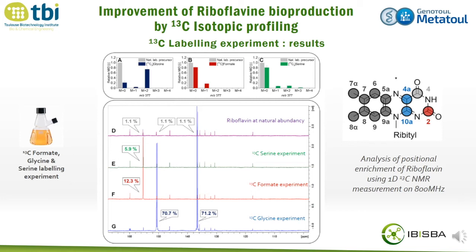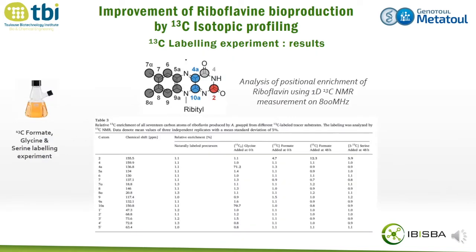Those results were confirmed with mass spectrometry analysis, with M+1 and M+2 species present in the analysis. So, for each type of label experiment, we measured quantitatively the C13 enrichment to evaluate the contribution of each substrate to each carbon, and the values are reported in this table. Luckily, we well identified the potential candidates at the beginning of the project as carbon donors for the C2, C4 alpha, and C10 alpha: glycine, serine, and formate.